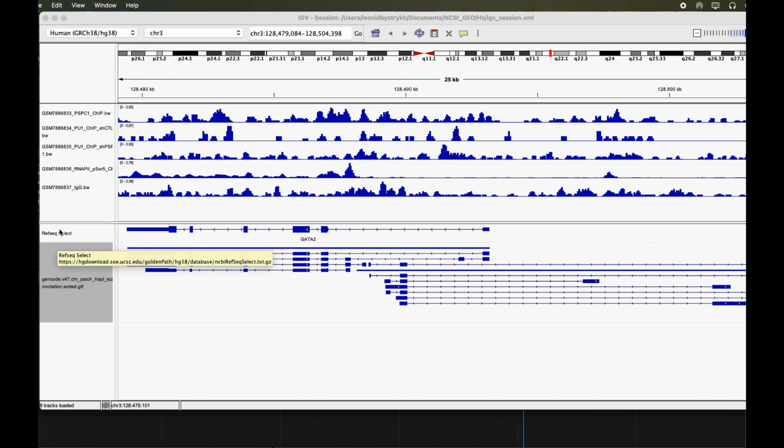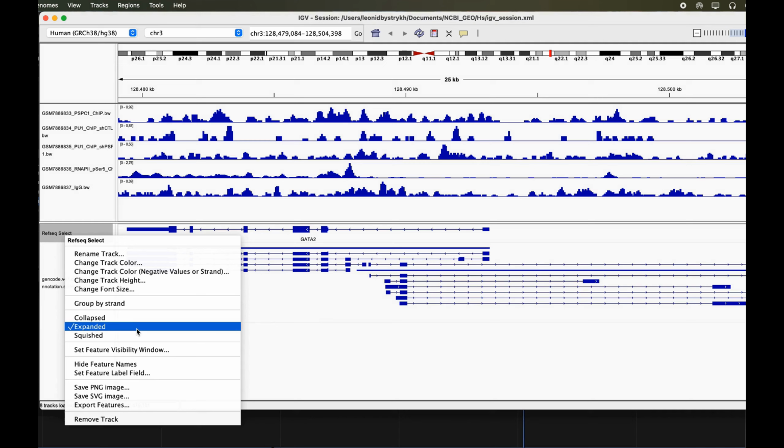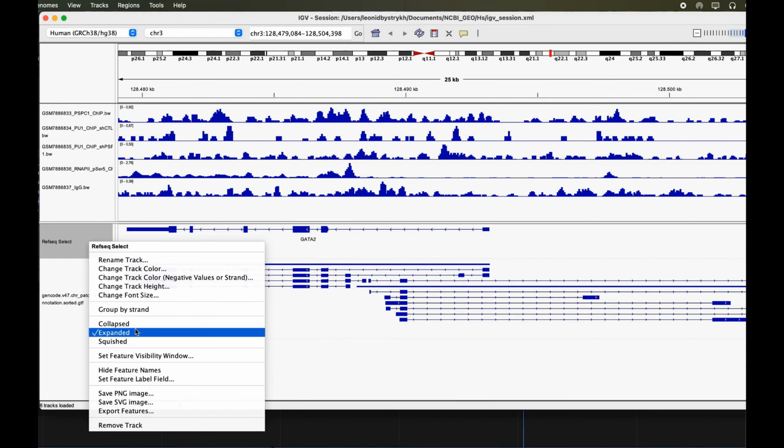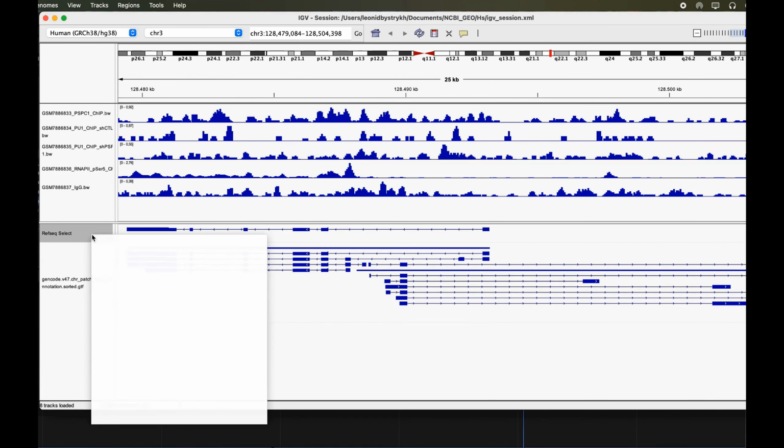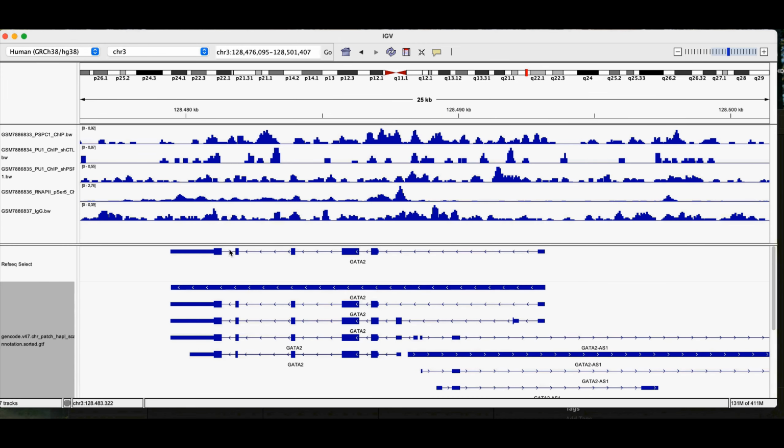You can also try to expand the original annotation, but it will not change. The self-downloaded version is more detailed, and if you like it more, use it, and you can use both of them next to each other.